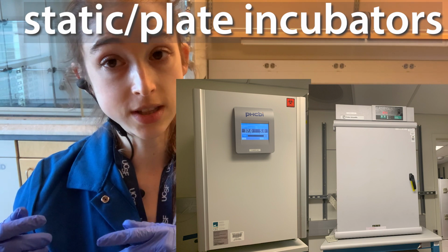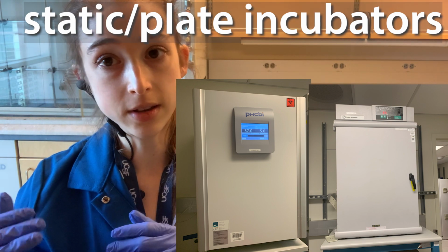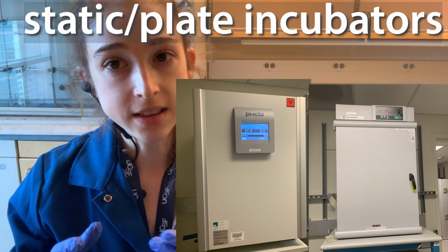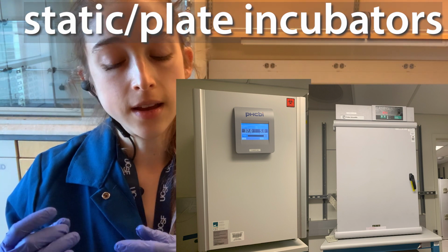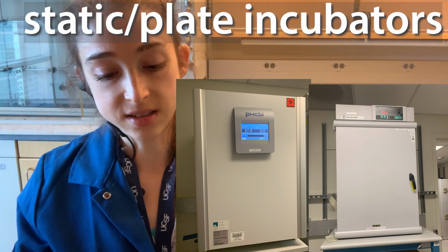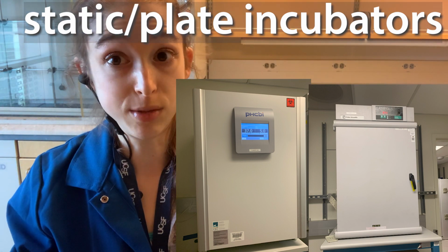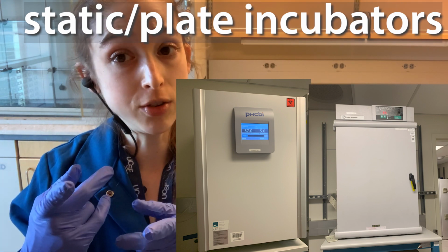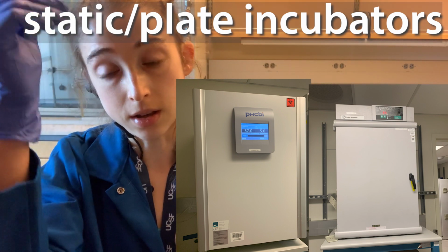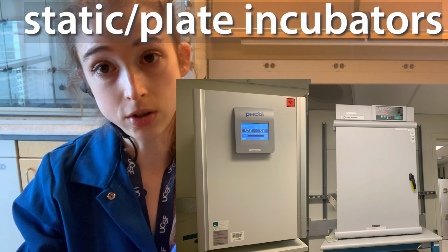And sometimes you are growing cells that don't need to be shaken. So those petri dishes that you plated, or if you're working with adherent mammalian cells, where the cells are actually stuck to the dish, in these cases you don't need the shaking. And so we just have these plate incubators, which are basically chambers with shelves, and you put your plates on them. If you're putting petri dishes, put them upside down so that condensation that forms on the lid doesn't drop down onto your sample.